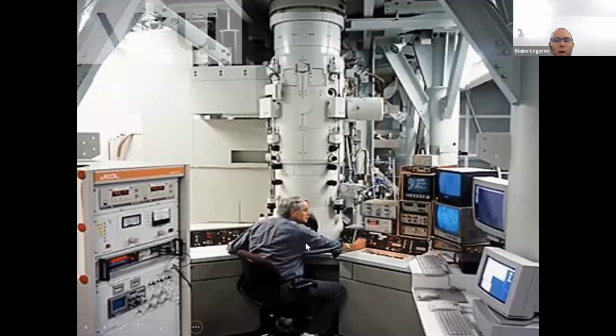He's probably paid a lot. For transmission electron microscopes, there are not a lot of really skilled technicians out there. And so these people are paid decently because often they're doing what only 10 people in the world can do in some cases. You can see a whole bunch of computers and hopefully he's getting some nice images.